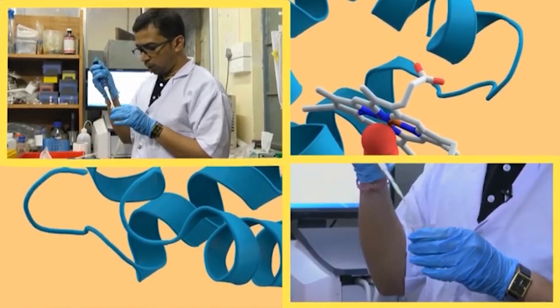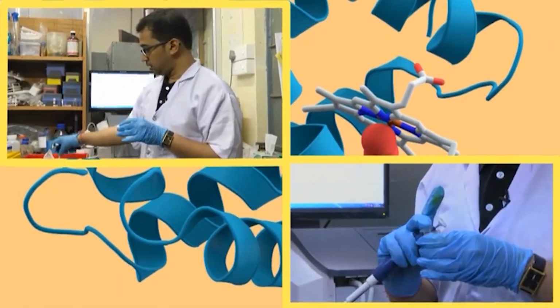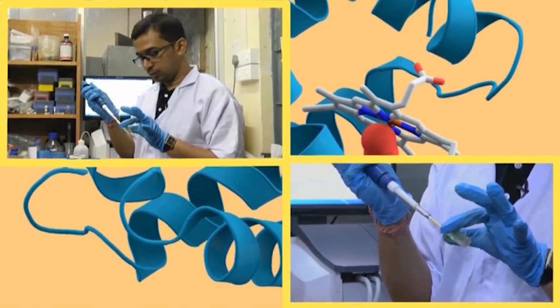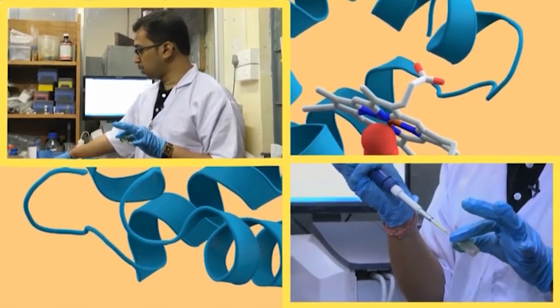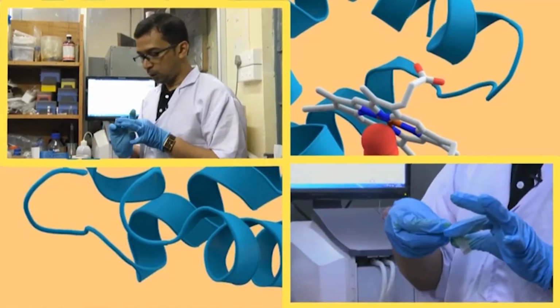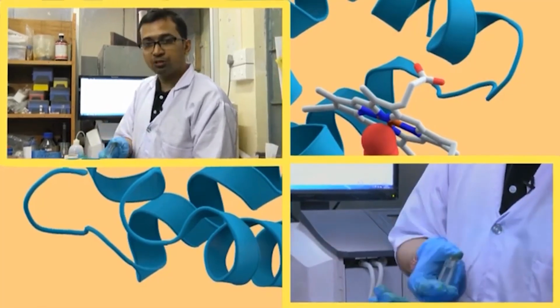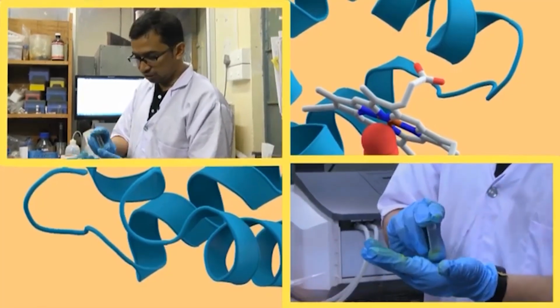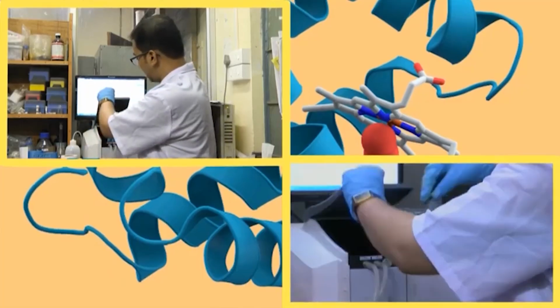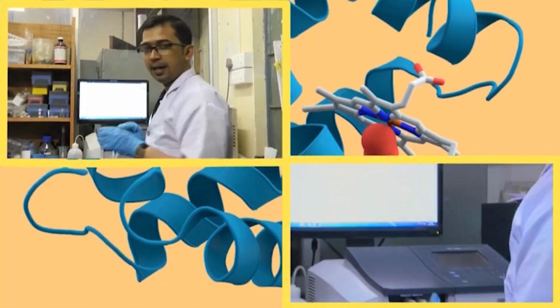So, generally some confusion arises about how many readings one should take. Okay. It is always better to take a minimum of 8 to 10 readings. Out here, due to the tutorial class, since we are concerned with the nature of the curve, we are not going into details on the number of readings. Out here I am taking 5 to 6 readings for curcumin, a bit fewer in this case. But while you are doing an experiment, make sure to take a minimum of 8 to 10 readings.